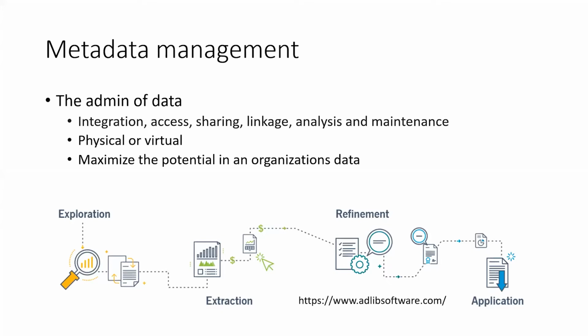Metadata management, therefore, is the administration of data. It determines processes of how data is integrated, accessed, shared, linked, analyzed, and maintained. The management applies to physical and virtual data formats, and resources are consumed in this task to maximize the potential of an organization's data.